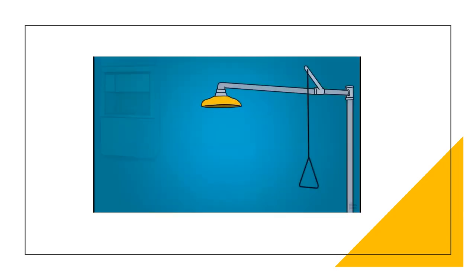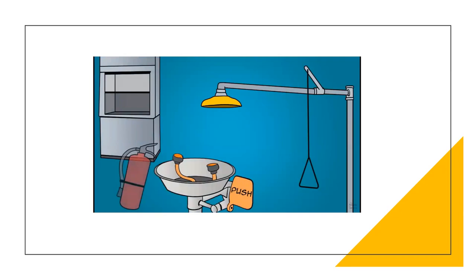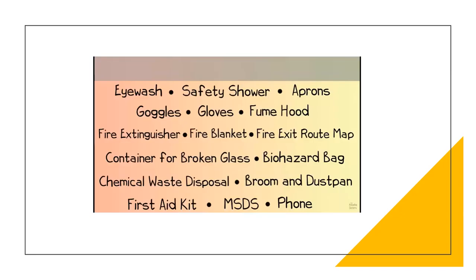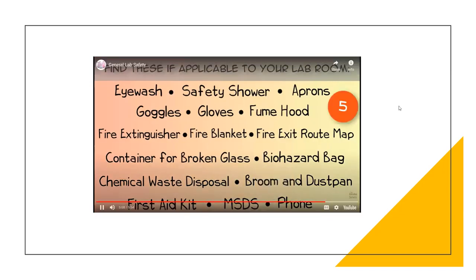Okay, so yeah, that was a lot. And there are so many more safety guidelines that may be specific to the lab that you're going to do. So you always want to go through specific guidelines in advance of your lab. We're going to put some items up here so you can pause this video and determine where those items are if they're relevant to your lab room.